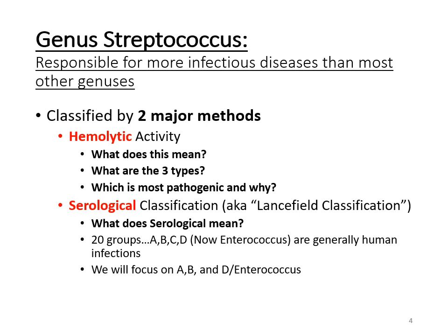Notice that I point out that D group is actually no longer called group D. It's actually called Enterococcus. Now, in this online lab, the three that we're going to focus on are group A, B, and Enterococcus, because these are three of the ones that have some species that cause a lot of human infections.